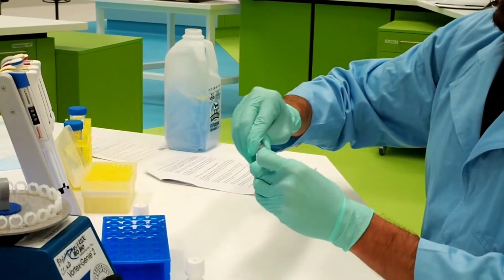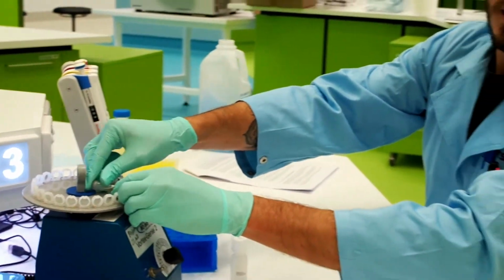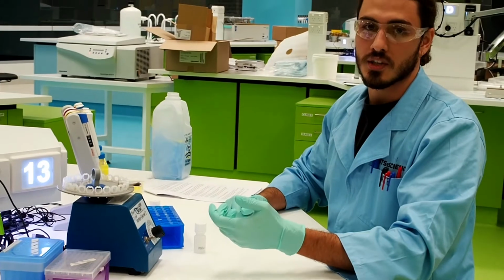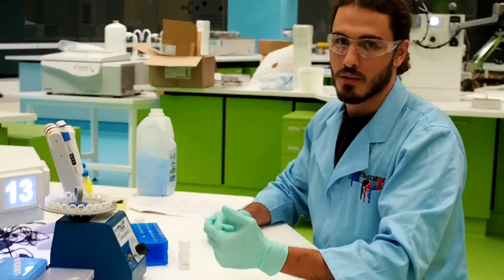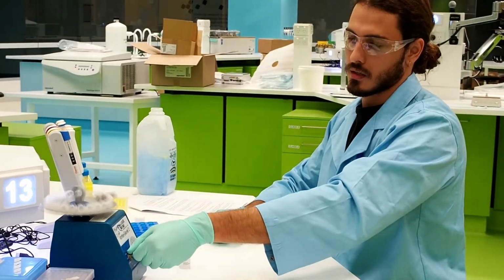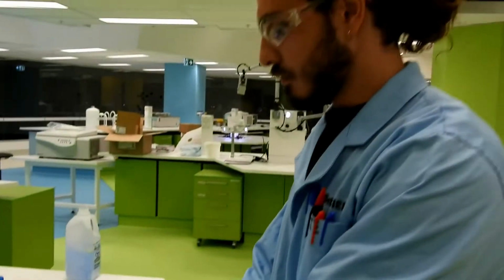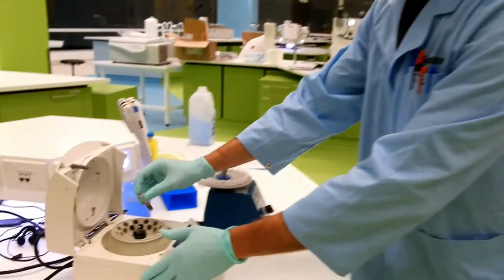We'll then put the sample onto the vortex for 10 minutes, and this will help to break apart the cells further and to homogenize the sample as the DNA gets released from the cells. After vortexing for 10 minutes, we then put our sample in the centrifuge for 30 seconds at 10,000 g.